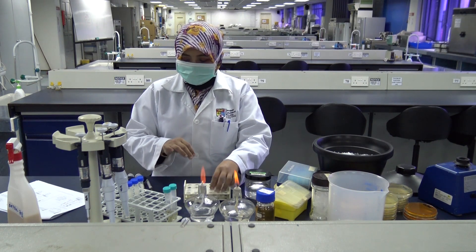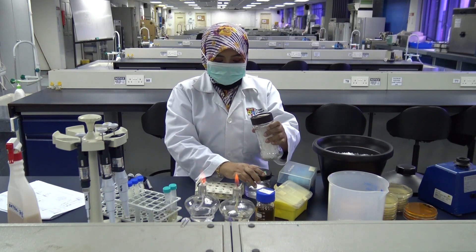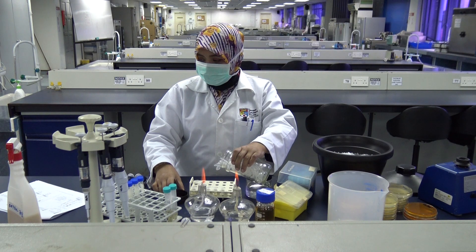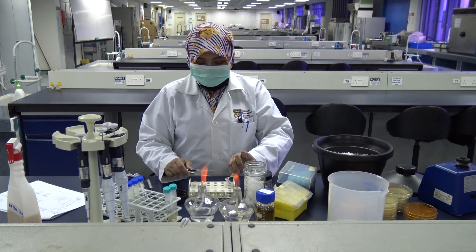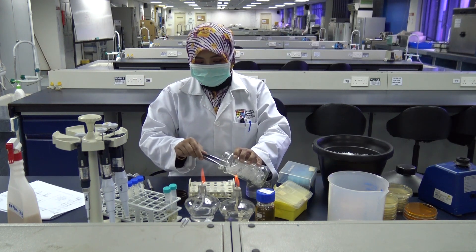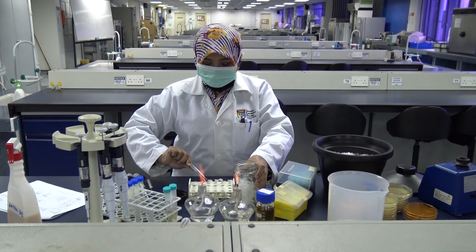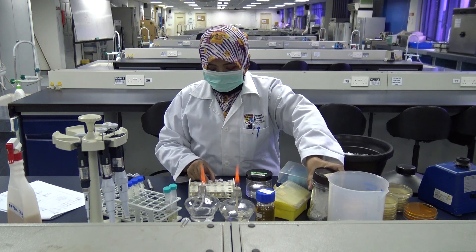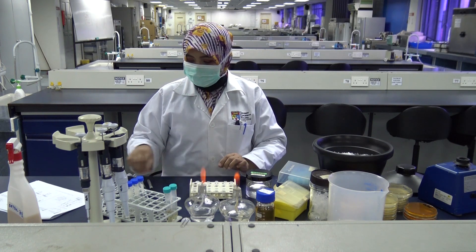For this, you have been told to prepare dilutions as stated in the protocol: 10 to the minus 1, minus 2, minus 3, minus 4, minus 5 — so you will have five sets of dilutions for each of your recipient cells and the two donor cells. From our earlier calculations, you need 900 microliters of LB media as your diluent and you will add 100 microliters of the sample to be diluted. First, add 900 microliters to your five tubes.